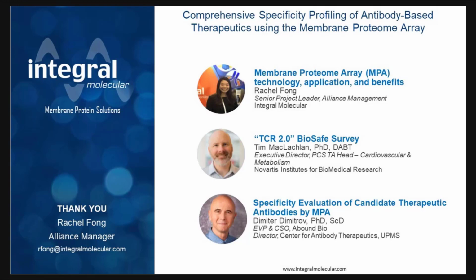No, we didn't have any. So I think for both viruses and cancer, especially if you are going to put them in humans, it's very important. So we will always test with the membrane proteome arrays for both viruses and cancers. For SARS-CoV-2, we tested many antibodies, at least, I showed you 4, and we never found any cross-reactivity.